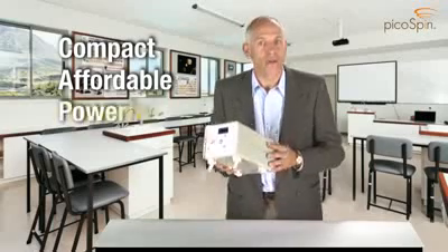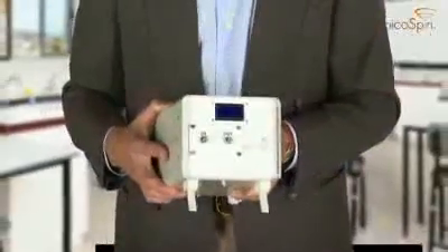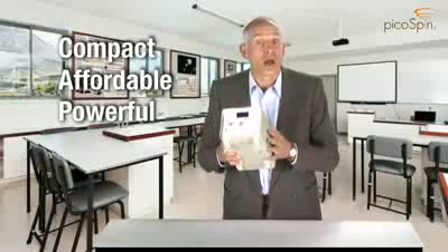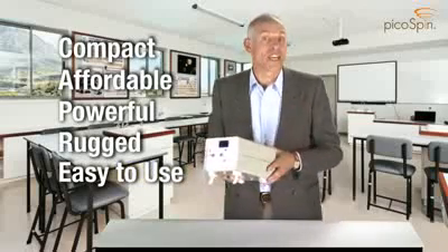It's powerful. Unlike other small NMR machines, the PicoSpin45 is a true spectrometer. It can resolve proton chemical shifts and multiplet splittings. And finally, it's rugged and easy to use. It won't take your students more than a few minutes to get a spectrum from the PicoSpin45.